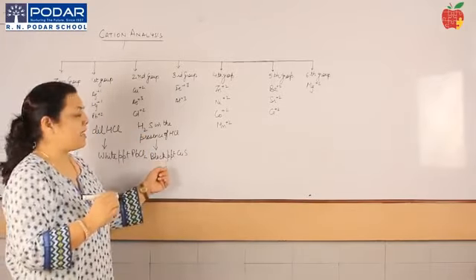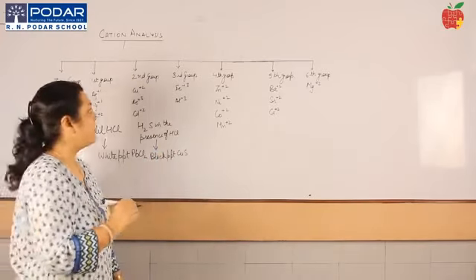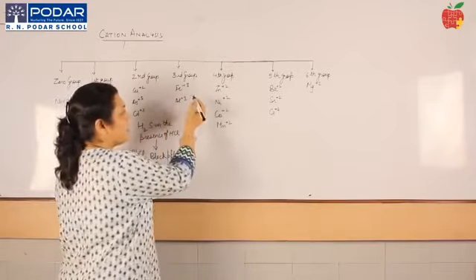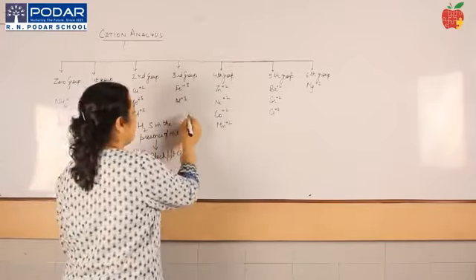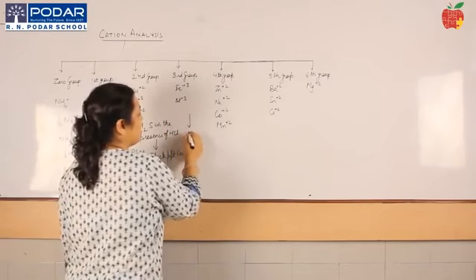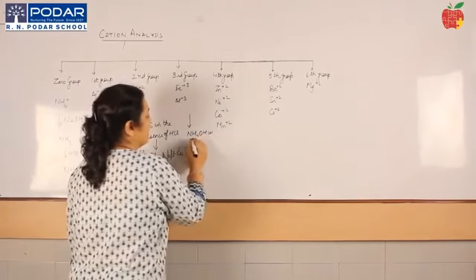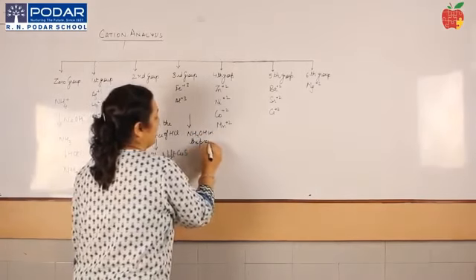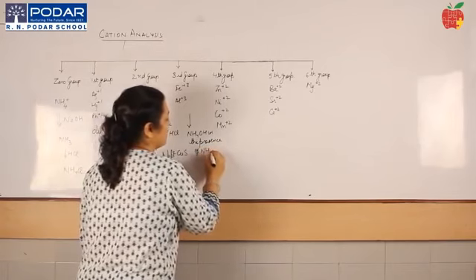Again, if you don't obtain any kind of observation in this, we move on to the third group, where you have ferrous and ferric, but usually we do ferric ions only, and aluminium. The group reagent here is NH4OH in the presence of NH4Cl. When I say in the presence of NH4Cl, that reagent is added first.